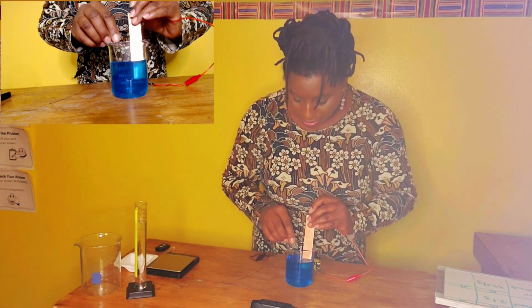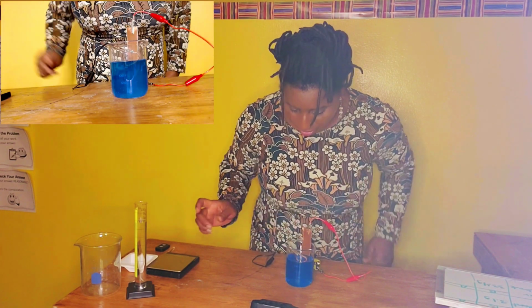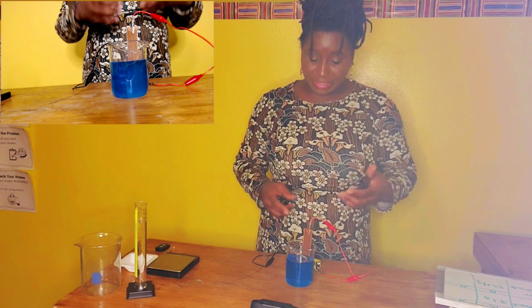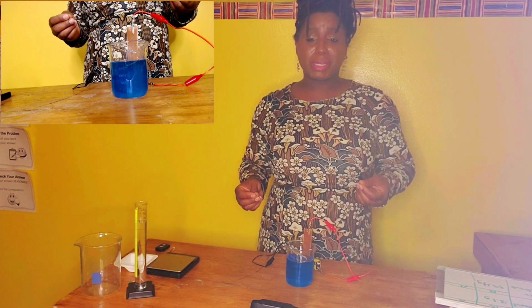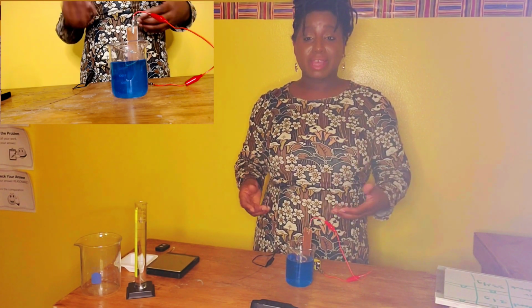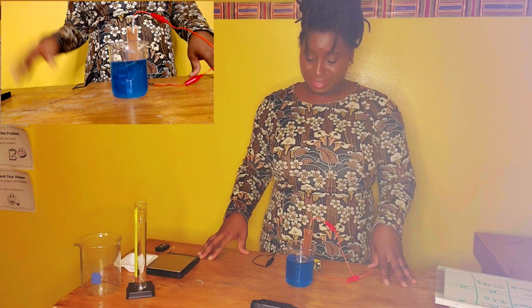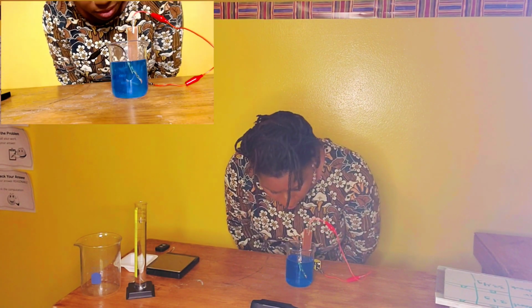Make sure that the copper electrode and the object that you're electroplating do not touch. Otherwise, you will not get a proper plating. So now that everything's connected, let's go ahead and place these in the solution. All right. Now, we won't be able to see much happening right now. We're gonna let this electrolytic cell run for about 30 minutes. After about 30 minutes, you will see a change. We're gonna see a change in mass and we're gonna see a change in color. So meet me back here in about 30 minutes. I'm gonna fast forward that for you guys and we'll begin to see a change. I'm gonna dip this back in here. Wonderful, wonderful, wonderful. Just making sure that they don't touch. I'll see you in just a few.